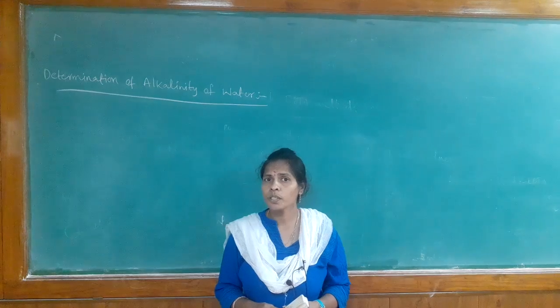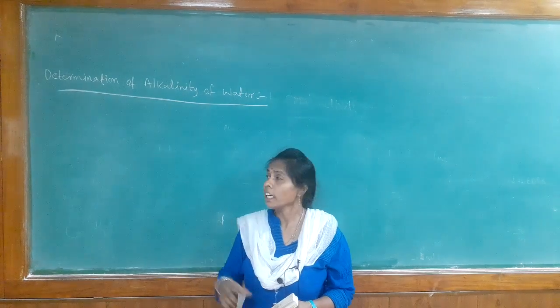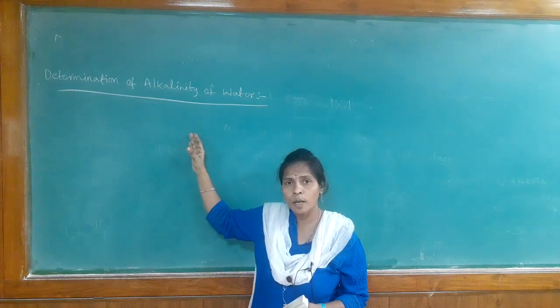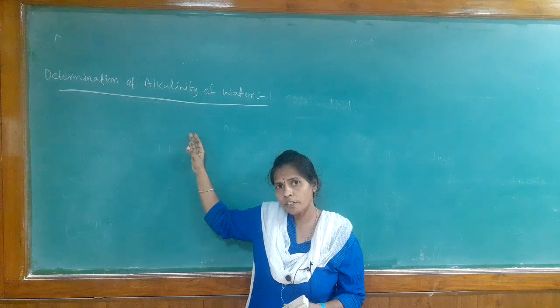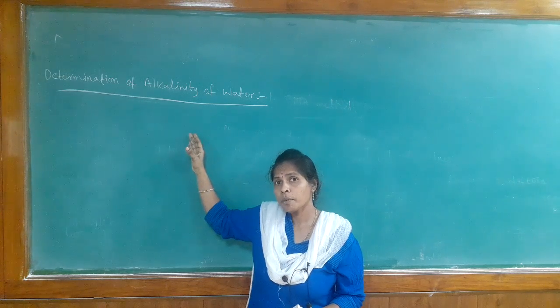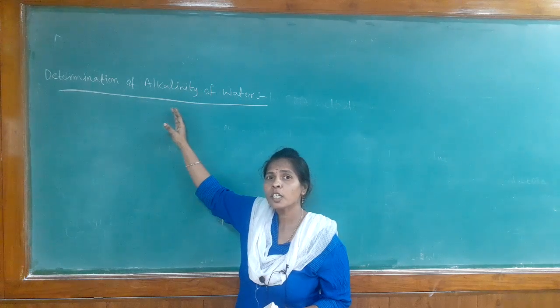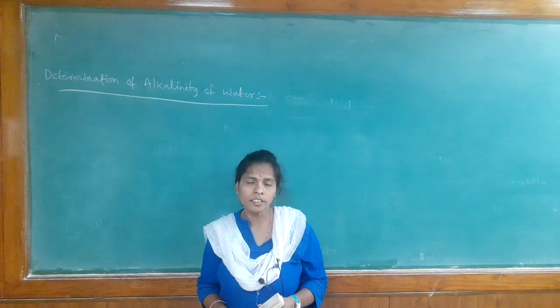Before going to determination of alkalinity of water sample, let us see what is meant by alkalinity. It is also one of the laboratory experiments. It is part of our experiments, part of our syllabus in the chemistry lab. Here alkalinity is nothing but basicity. Do you know what is meant by basicity?